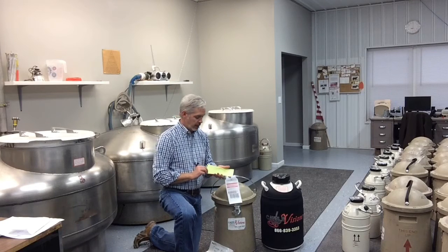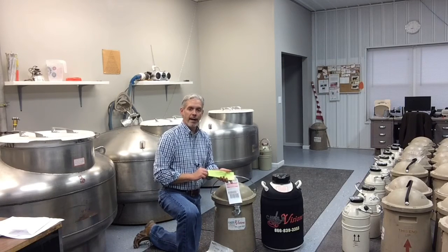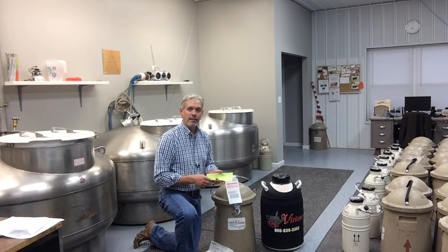There'll be a small sheet that gives you instructions on how to contact FedEx, or how you can go to CattleVisions.com and set up a pickup request so that FedEx will come and pick up the tank and return it to CattleVisions.